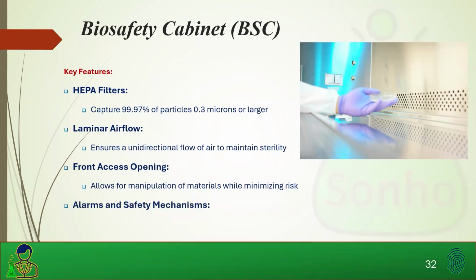And alarms and safety mechanisms. These alarms alert users if airflow is compromised. Most times, these systems come with airflow alarms for the front, for the back, and the door. If the door is raised too high, then potentially exposing the technician to the hazards, alerts will go off, and therefore the technician will know what to do next. Biosafety cabinets are a critical part of a laboratory infrastructure, ensuring compliance with biosafety regulations and maintaining a safe working environment.